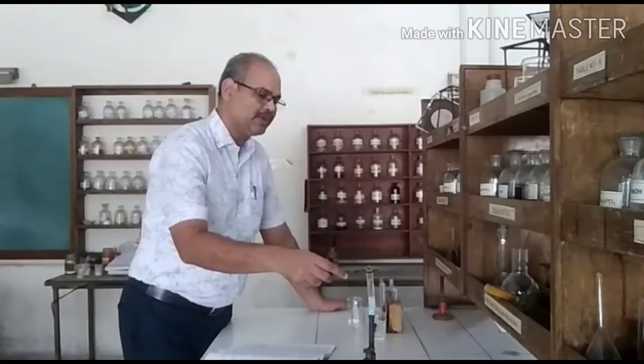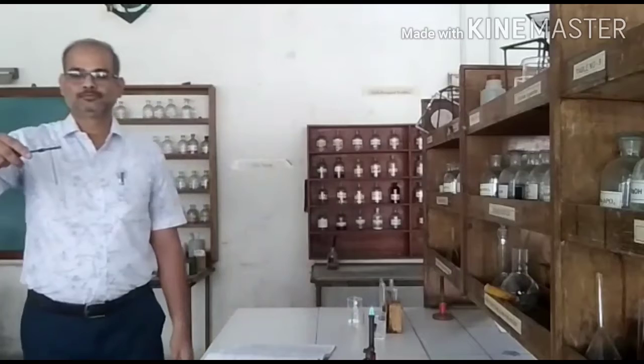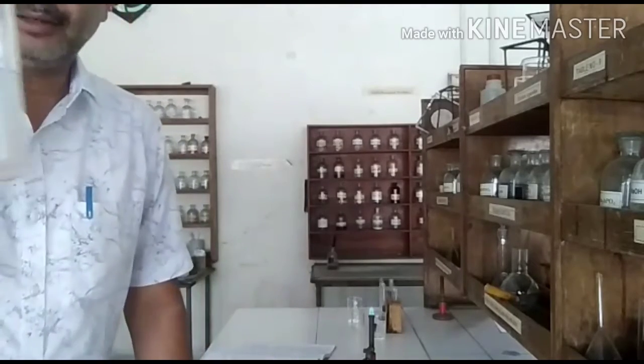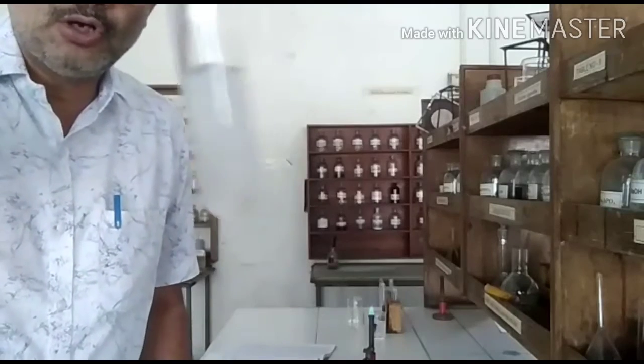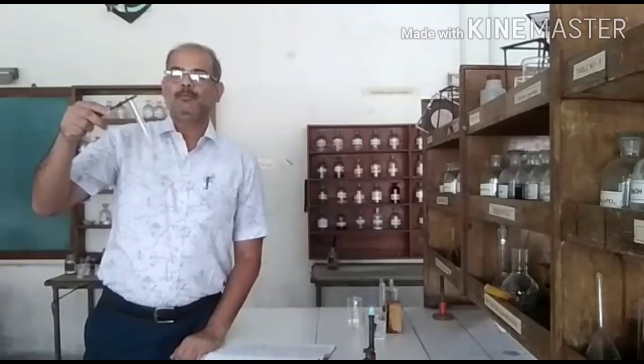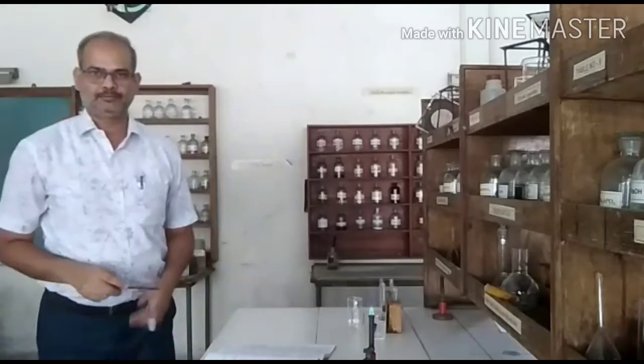I will slightly warm it and then check the solubility. On warming, you observe that the PPT has dissolved. You have got a clear solution. It is a bit turbid, but there are no solid particles in it.